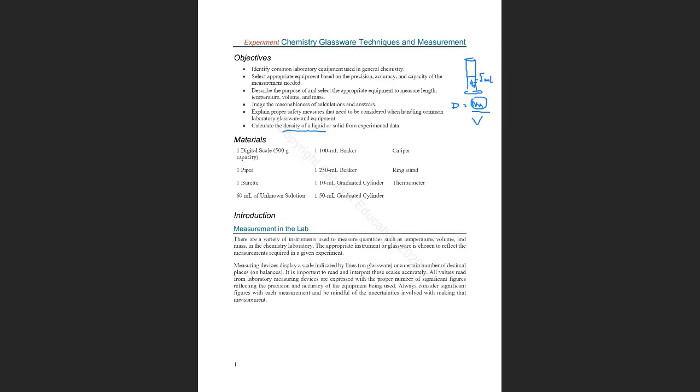And depending on what is the precision of the mass, which kind of balance you used, you can have 1.1 grams, depending on the balance, or 2.1 grams, or you can have another balance that will give you 2.103 grams, or you can have a balance that will tell you 2.1034 grams. So depending on if you use an analytical balance or a small balance, you will have a different amount of digits. For the analytical balance, you need to write all the digits. And for the volume, depending on what you use.